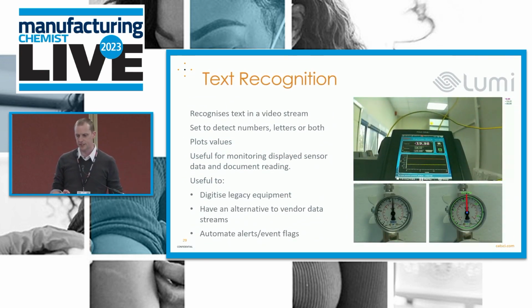If you give tools to chemists, or I'm sure all scientists or engineers in general, they'll find interesting uses. Some things that people have started doing in the lab is digitizing things which they wanted to digitize that either we didn't want to fund the vendor to pay for their digital interface, or that doesn't exist, it's an old instrument, or in the case of those dials, just a pressure gauge. If people suspected some issue with pressure fluctuation, they can monitor that. In this modeling mode, you can turn that image into a plot, an XY plot of pressure against time, and then you can discard the video, so you don't need to store that in the cloud. So really useful tools.